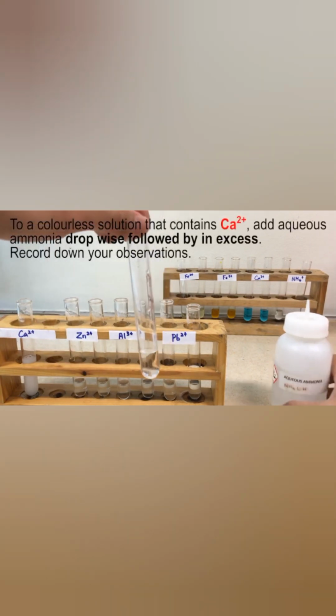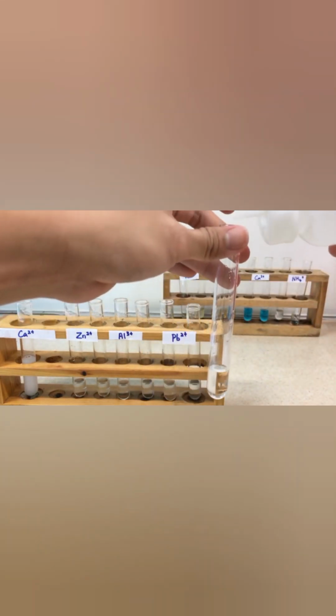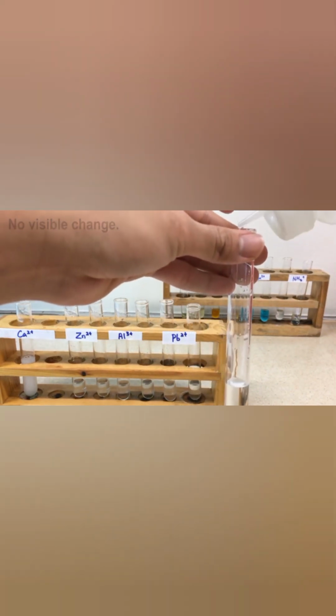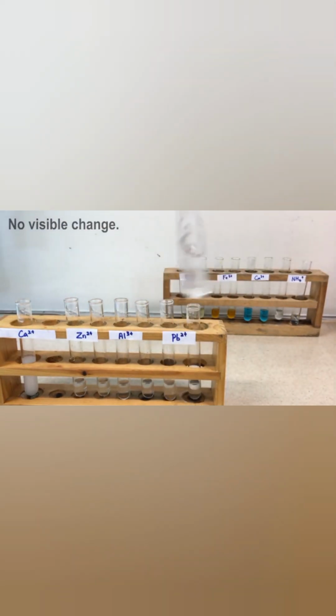Okay, we will now add aqueous ammonia to a solution containing calcium ion and see what happens. In drop, you find out that there is no visible reaction when aqueous ammonia is added to calcium ion. Look through it, there is no precipitate. Now if it's added in excess, there is still no visible reaction, which means aqueous ammonia does not react with a solution containing calcium ion.